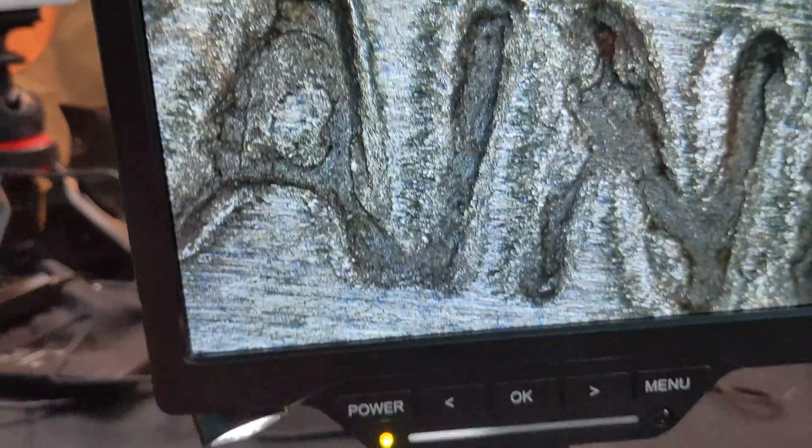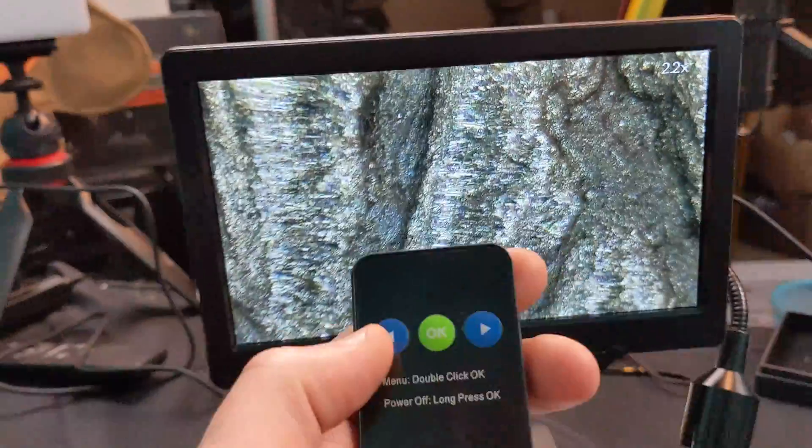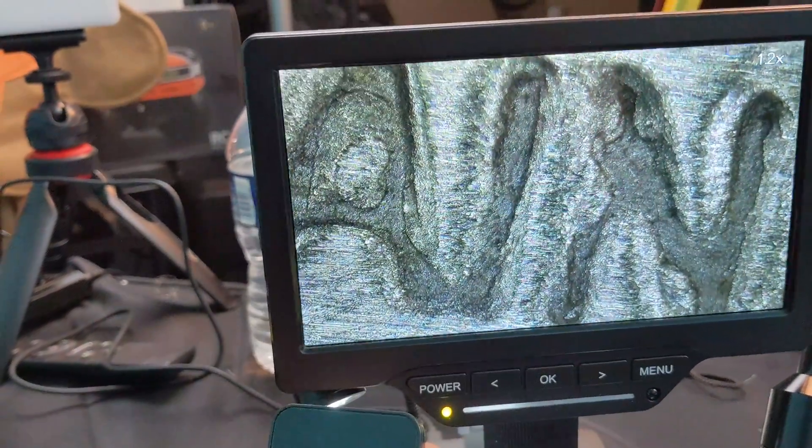And of course you can zoom in further. You can use the remote to zoom in and show even more detail. Look at this — incredible.